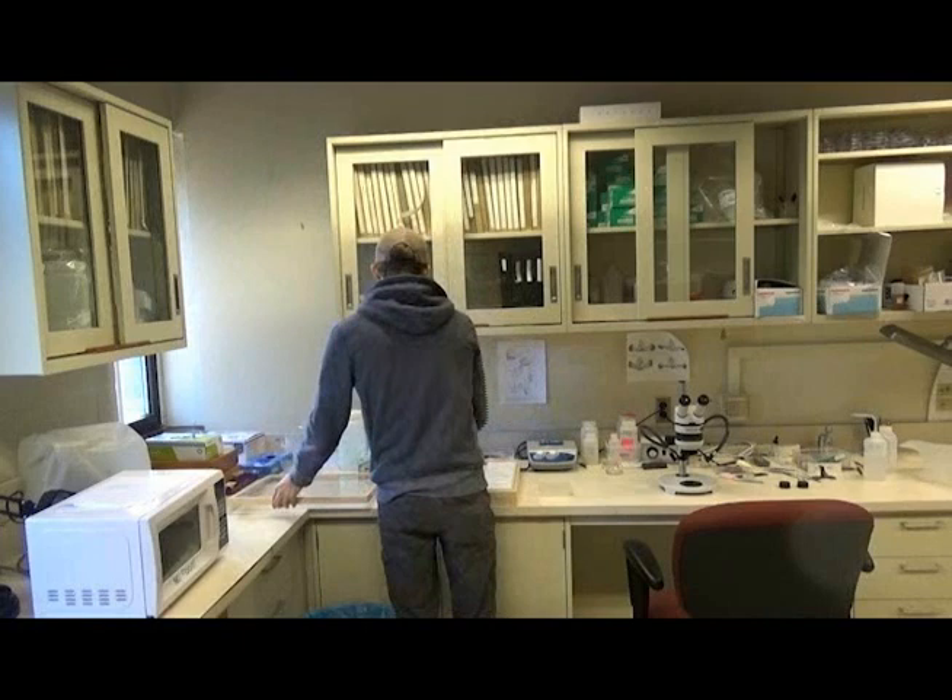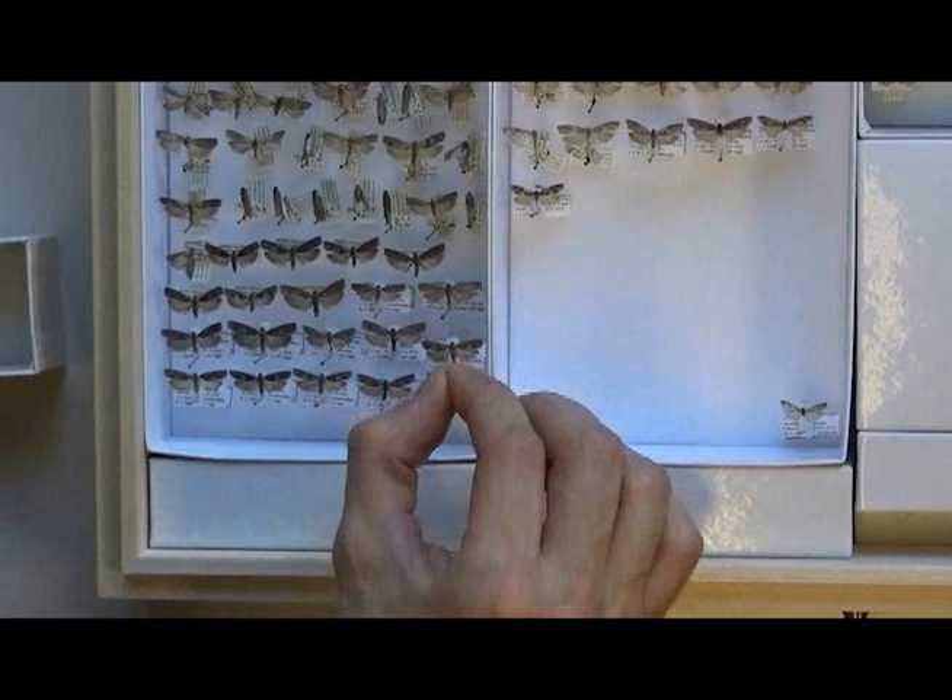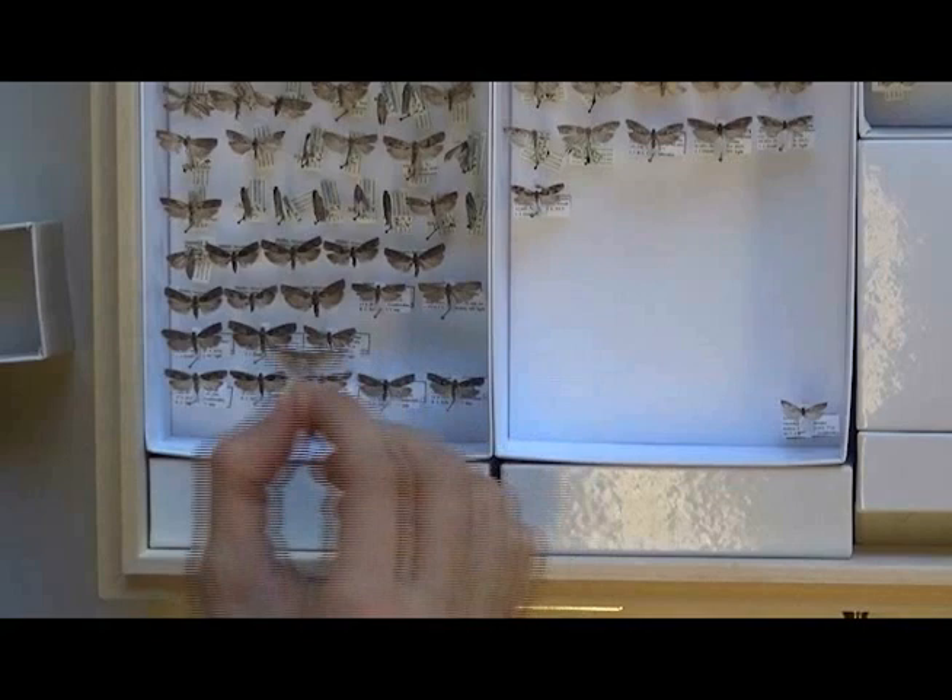In North America, the tortricid genus Pseudexentera is a late winter and early spring flying group. Externally, many species look very similar, so dissection is necessary to identify some of them. Here I am selecting a male and female from a drawer of unidentified Pseudexentera.